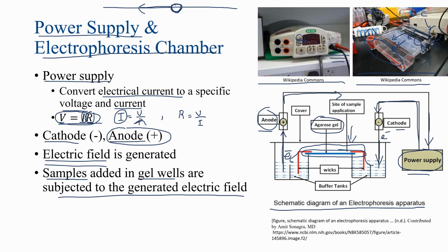So if you look at the particle that I drew in the wire, you can assume that this would be a positive charge if we are drawing the directionality of the current going to the left. However, this convention was created before the discovery of electrons, and it is actually electrons, assuming this is a metal wire, that would be moving and creating a current flow.